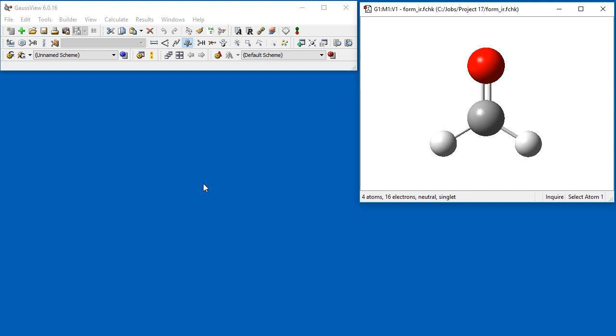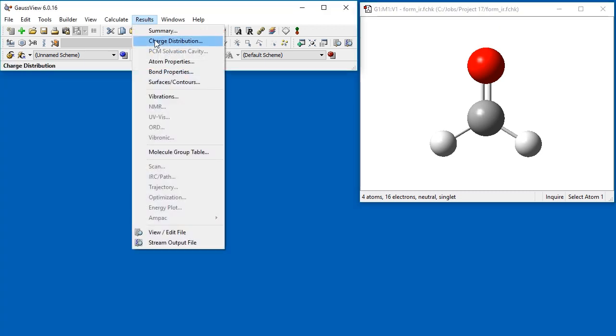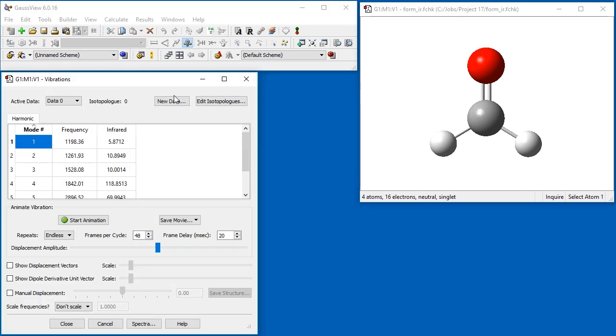re-optimizing the geometry is not required for different isotopologues. We've already opened the checkpoint file from a frequency calculation on formaldehyde. We want to examine the frequency analysis for the deuterated form. In the vibrations dialog, controls related to isotopic substitution are located at the top.